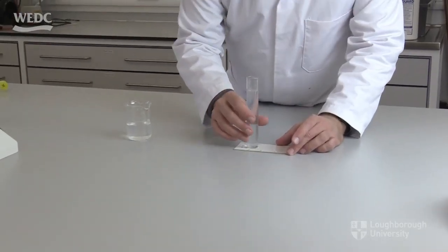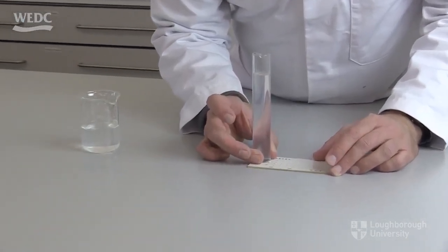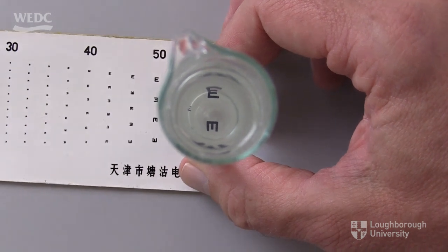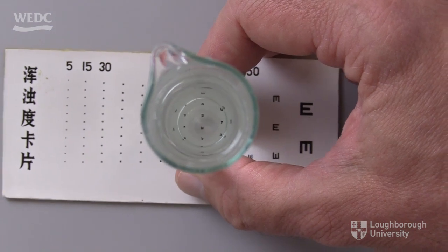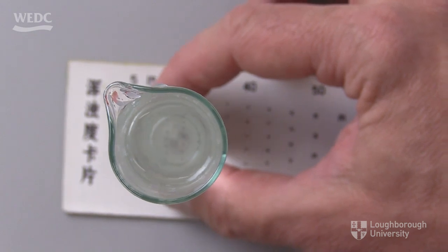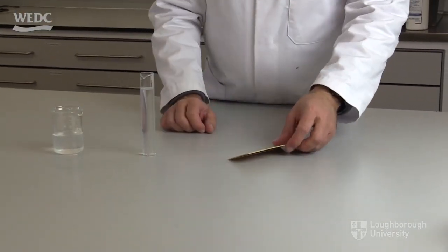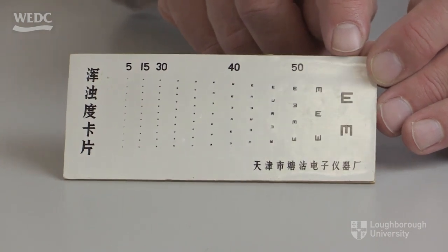To use this method, place the tube filled with your turbid water on top of the supplied chart of letters, then lean over and look through the tube at the visible larger characters printed on the chart. Next, slide the tube carefully across the chart towards the smaller characters until the characters can no longer be seen. Take a reading from the chart at this point. In this example, the reading suggests that the turbidity is somewhere between 40 and 50 NTU.